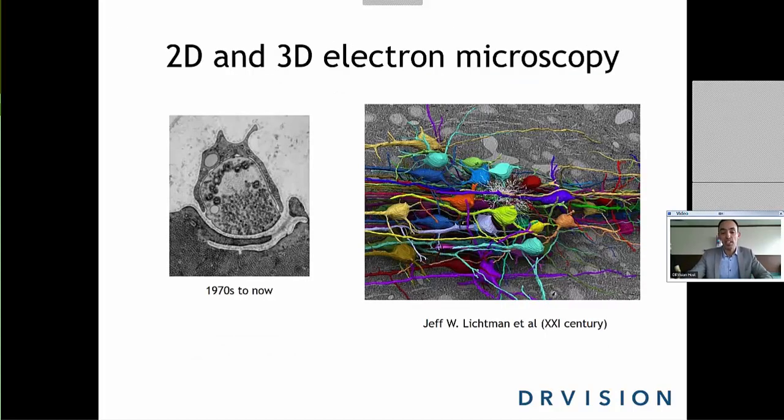But things have progressed, and technology has developed, hardware has developed, and with the advent of good or high-resolution TEM, we could start to see some of the nanostructures, and that really opened up the interest for the detailed structure in neurons and how neurons connect to other neurons. Here is a neuromuscular junction that we see here with a lot of vesicles, and that provides clues. Just the visual inspection of a data set like this, and this is a single slice, already provides clues about the biology.